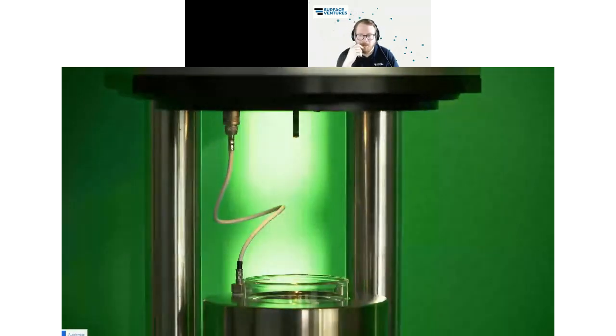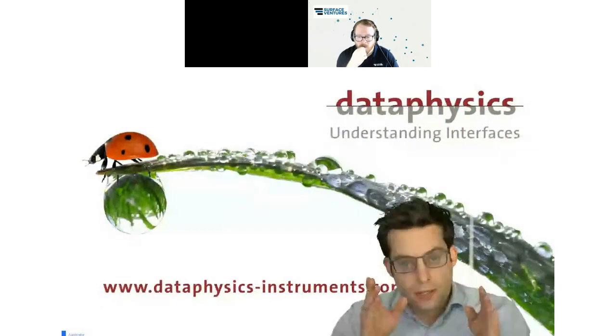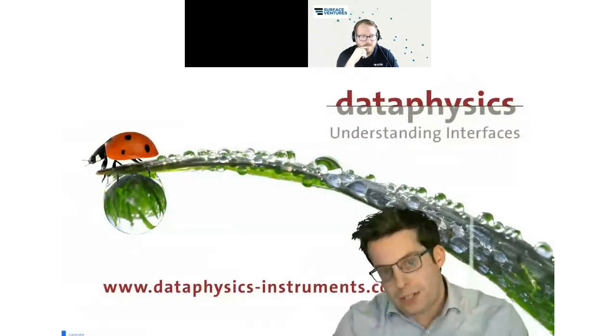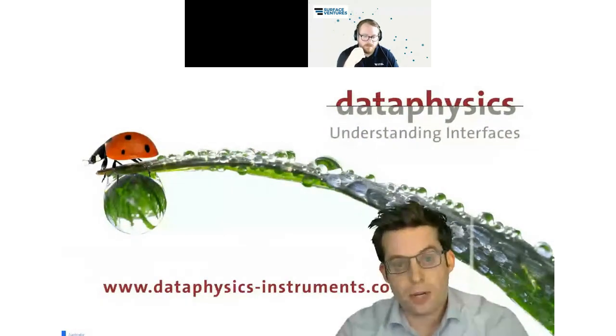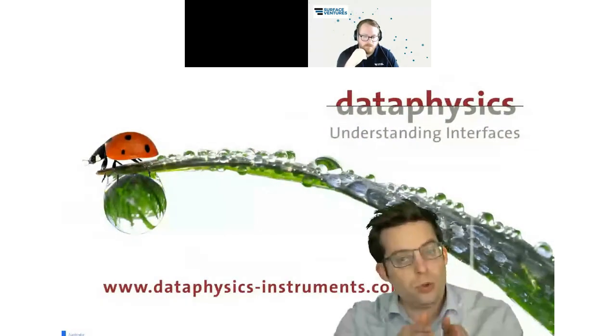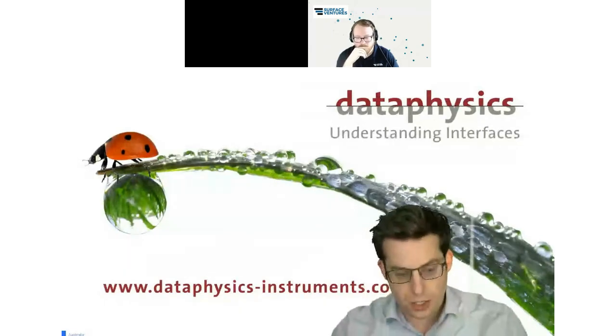This helps us to get the implant better wettable and then more well accepted in the customer's mouth. Since our time is a bit limited and we have a lot of questions, I want to use some results that I have already made before to show you the differences before and after plasma treatment for the imaginary contact angles.